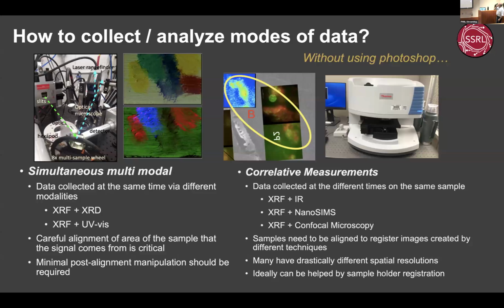The challenges here are, at SSRL, we've put some of these things together, right? We put a spectrometer on the beamline. We have a nice camera that can collect really nice visible images too. And we can do diffraction on some of the beamlines as well. If you do careful alignment, we can get multiple data sets that come out already pre-aligned, and everything's great. But it's really hard to put a mass spec on the XRF beamline, for instance. These are things that are never going to be done in line. We've thought about it, but it's just not really feasible.